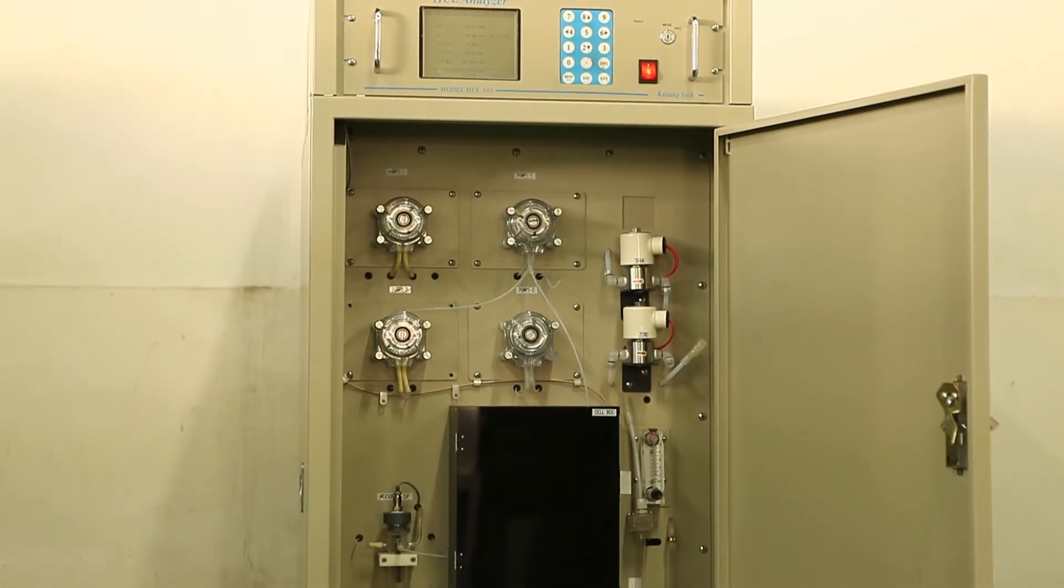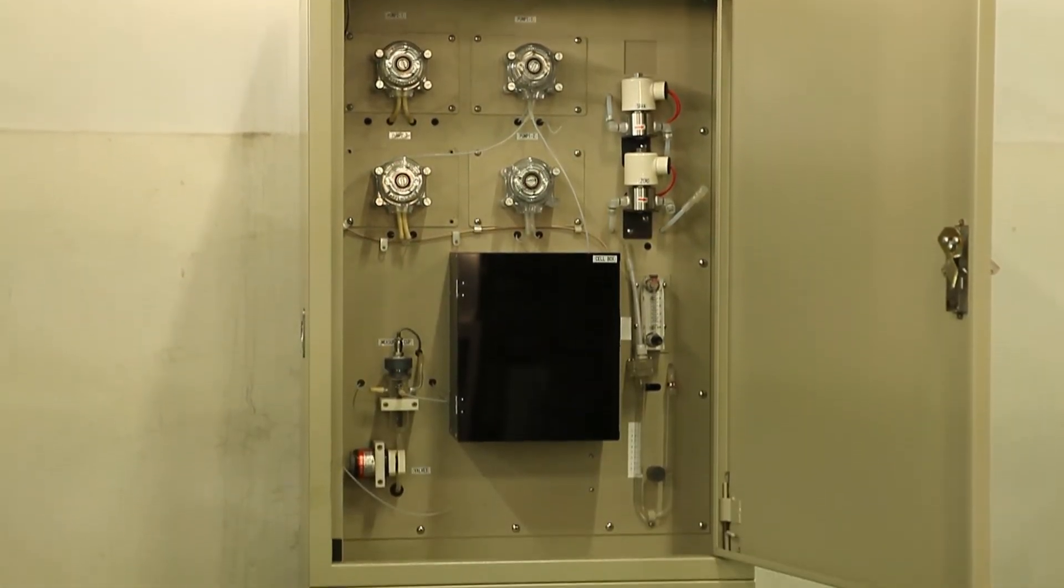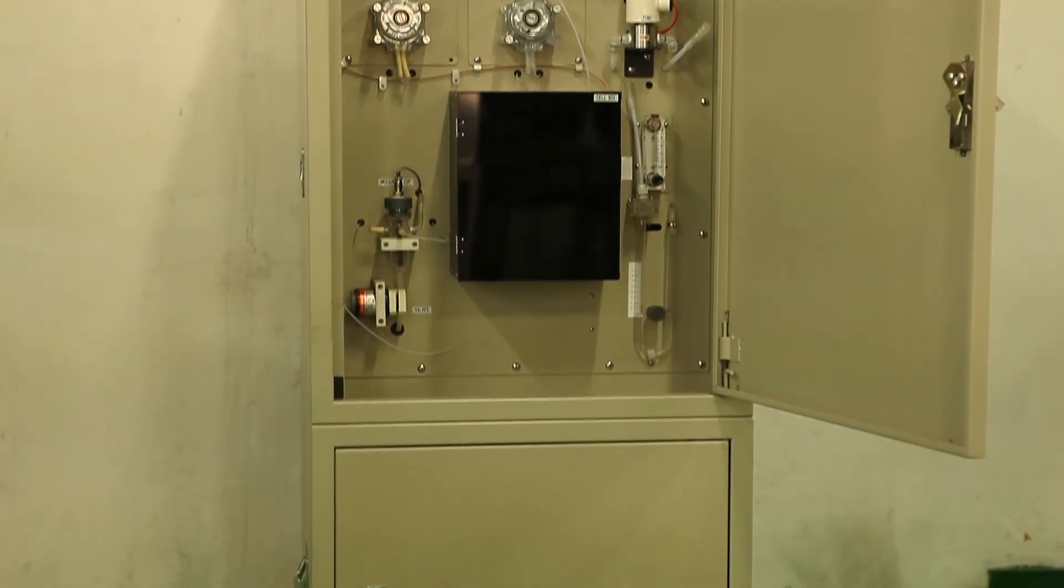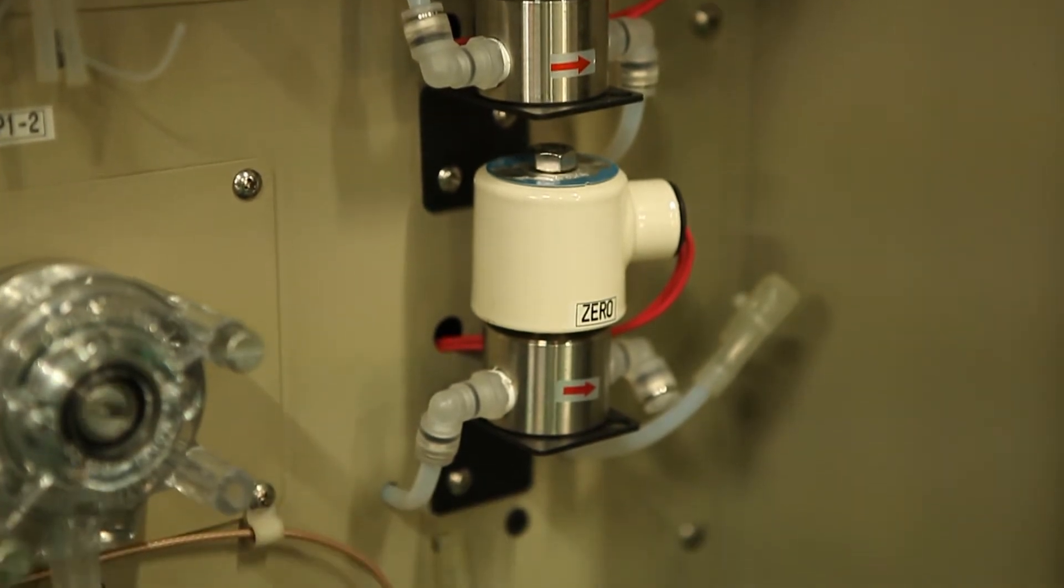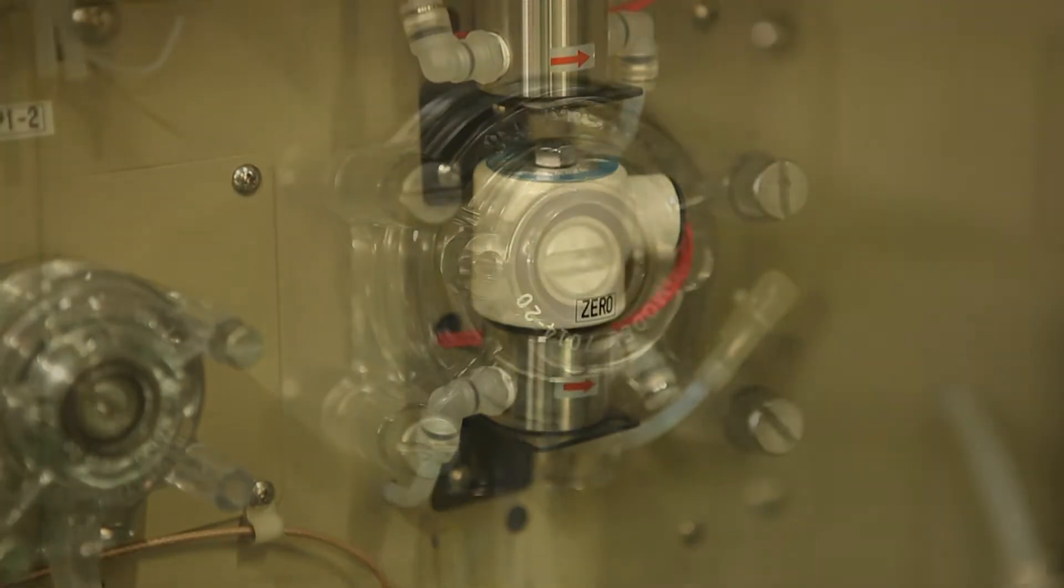HCL 103 applies a metal film electrode to a detecting element, so it has better reproducibility and reliability than the devices that use the existing rod electrode or magnetic stirrer type polishing electrode.